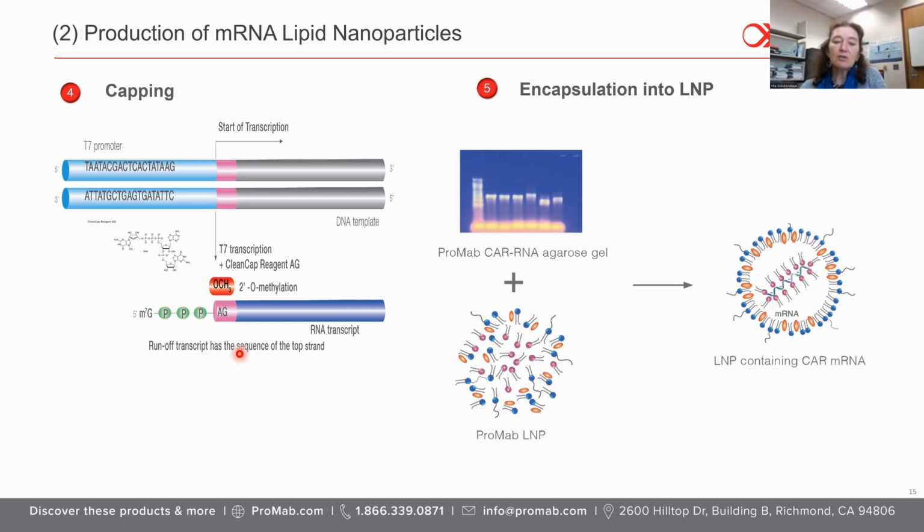And we also have machines, systems that can measure the size of nanoparticles. It's like 70 to 100 nanometers, and encapsulation with the RiboGreen assay. So this system, the nano generator, helped us in research to generate CAR-T cells, and antibodies and proteins can be used for vaccines and many applications. Yeah. Okay, thank you. So one last question.